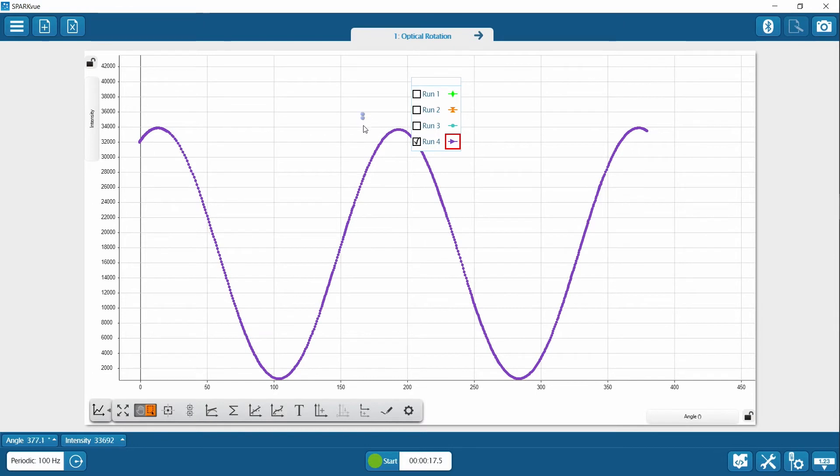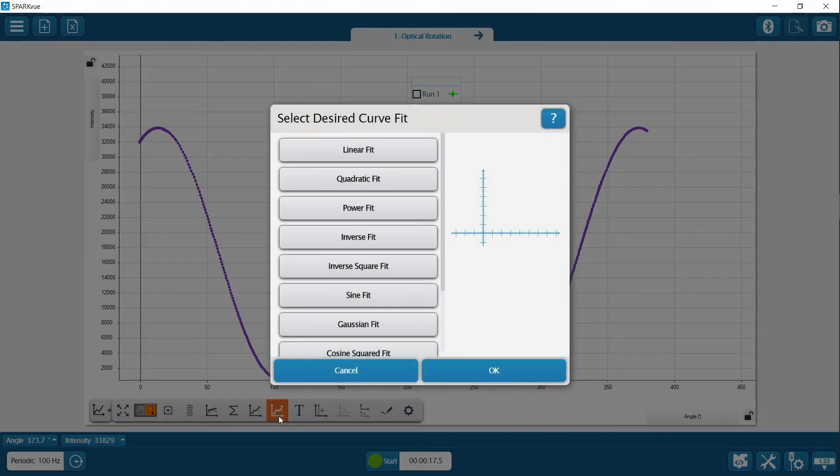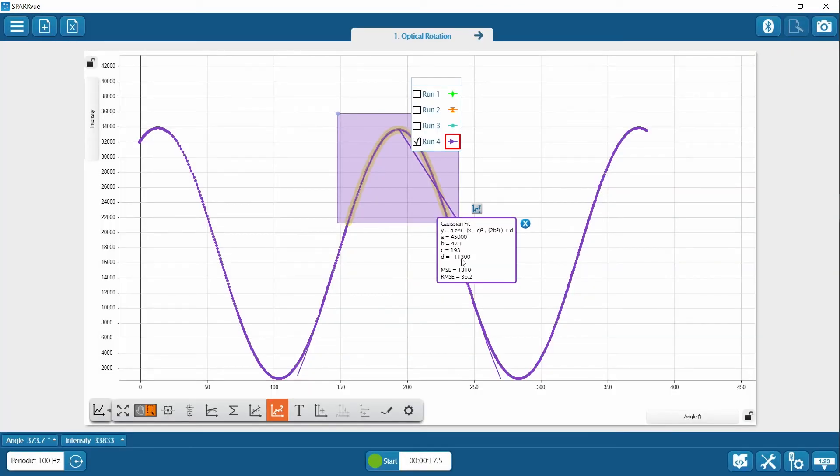We'll choose our selection tool, and we'll come down here and grab a nice symmetric amount of the curve. If you can't reach the top one, you can go to the bottom one, the tool in the toolbar. Choose your Gaussian fit, and we'll get a nice reading of 193.